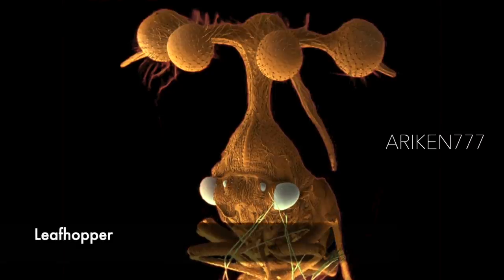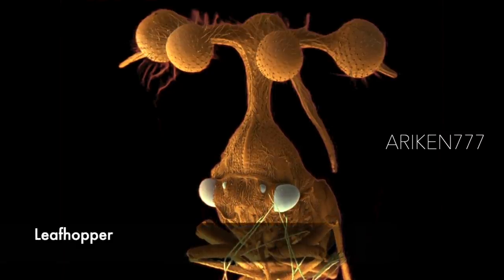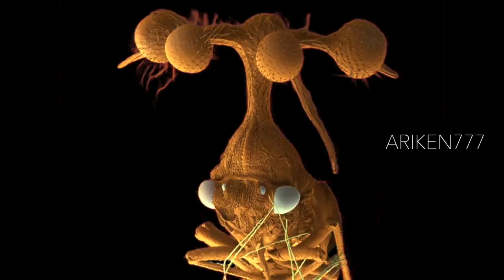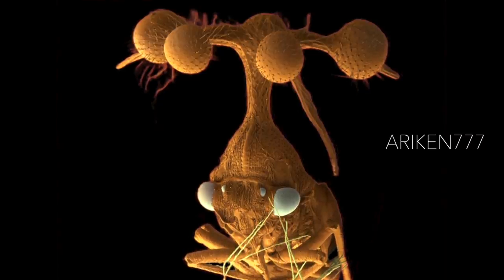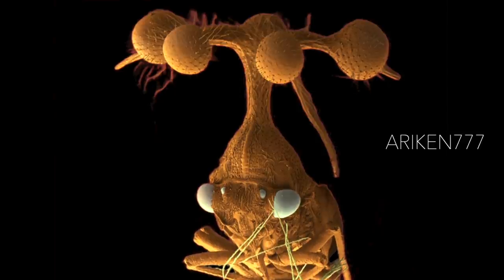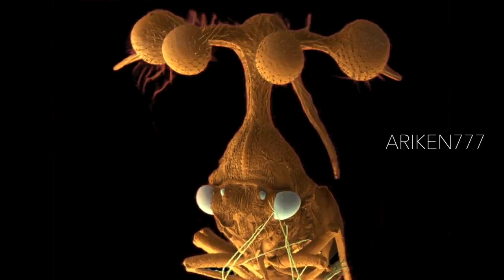A leafhopper. This insect has a ball-bearing appendage growing from the back of its thorax. The appendage, which is present in both sexes, is thought to deter predators or to help camouflage the insect.